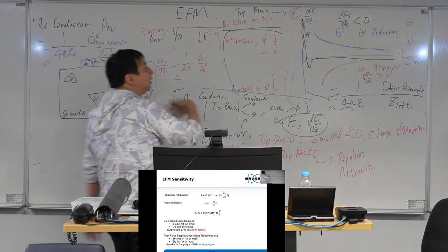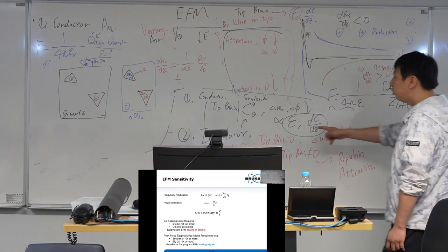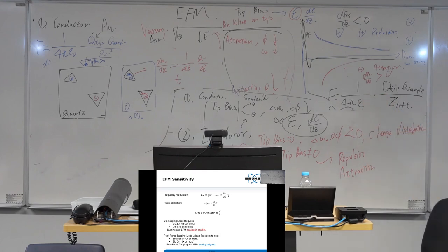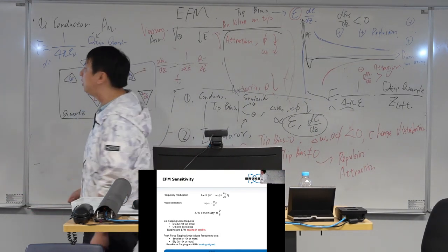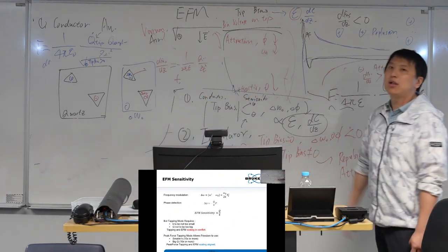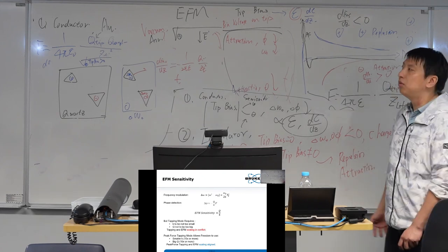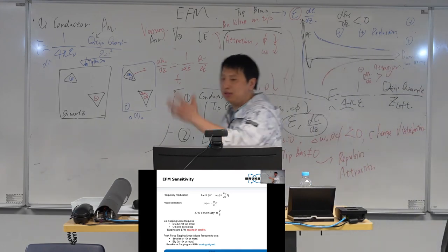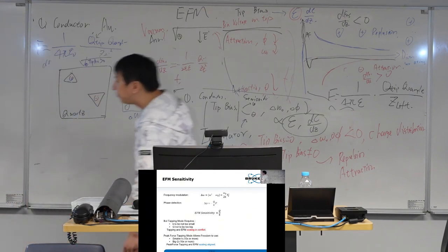Because the probe is conductive, we can consider the probe as a metal. And then we get the dielectric coefficient here. There's nothing to do with our probe, because the probe is a metal. If our probe is an insulator or a semiconductor, this term will contain the tip. So we recommend you to use the conductive probes for the EFM study. But if you are using non-conductive probes, you can still sometimes get the results. Okay?